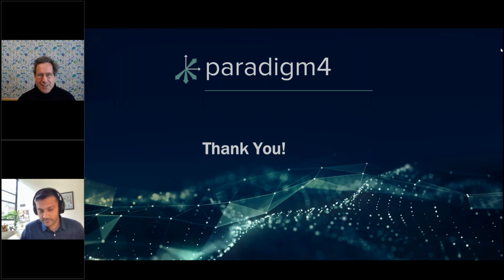Well, I think just the basic conception of what Allotrope's trying to do is extremely valuable, right? The challenge is, and I think that you see this in so many of the talks today, the nuances and the complexities of the different experimental designs that are implemented.